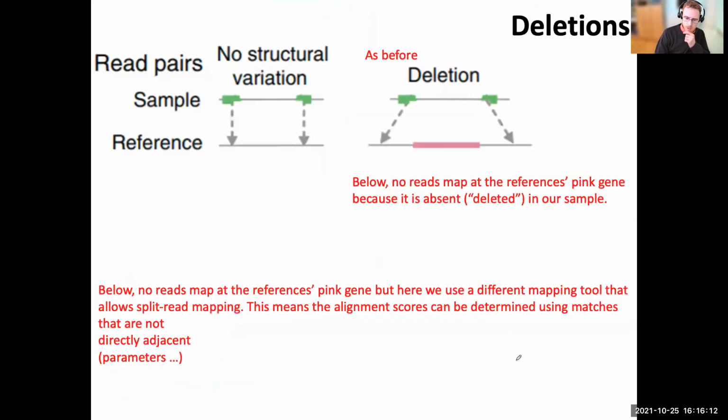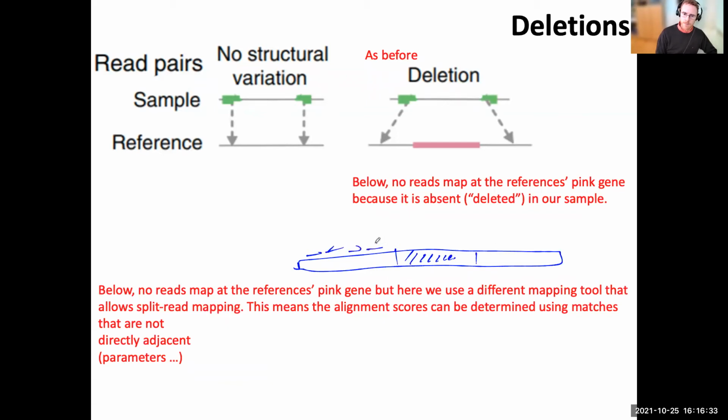These are more diagrams indicating the evidence of a deletion. The first one shows the classic example, which is simply that if we map reads to a reference where a region is deleted in our sample, you'll find that our reads are aligned there with each other, and then there's no coverage, if I use horizontal lines as our reads mapping at this region.